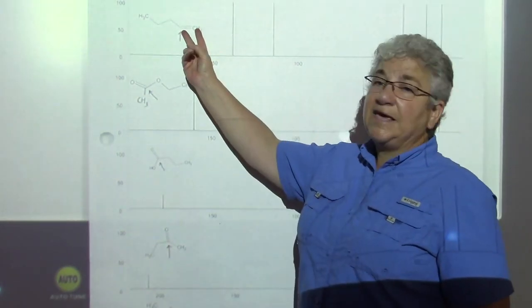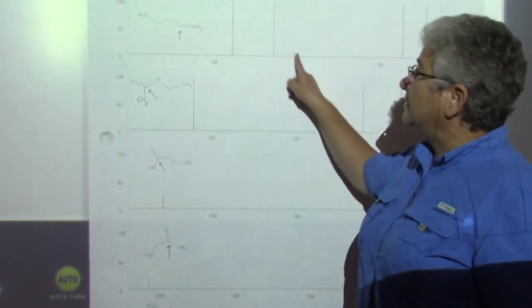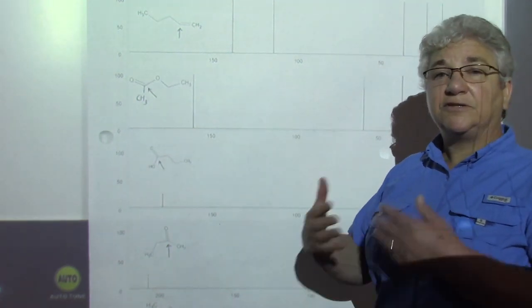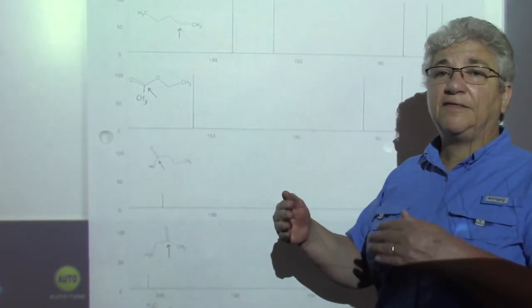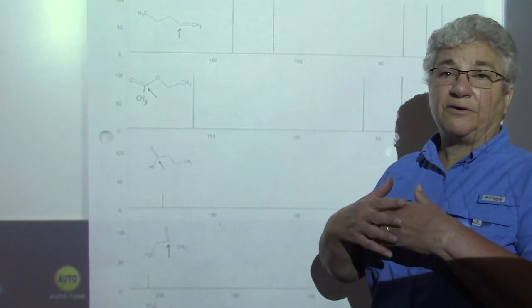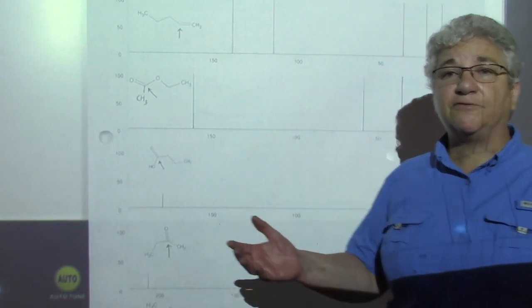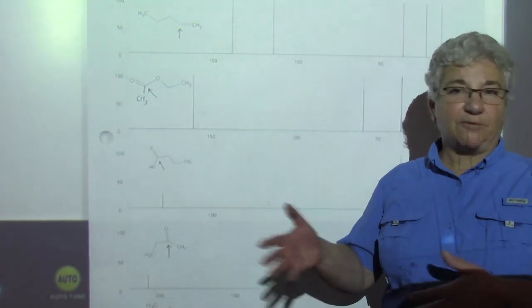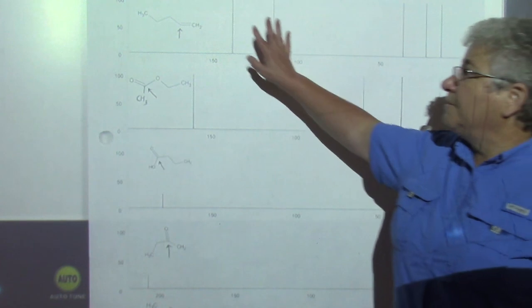Now I have an alkene, right? The 2 carbons of my alkene, they're back down in this region above 100. That starts to be like the aromatic region. And the truth is that the aromatic region and the carbon-carbon double bond region, so the alkene and the arene, those regions actually overlap each other. So without any further information, if you just tell me you have a peak at 154 ppm, I cannot tell you whether that's a double bond or whether that is an aromatic ring, right? Those regions overlap each other. We'll talk about all of this, right?